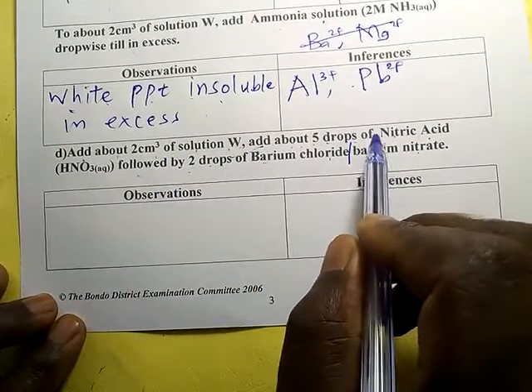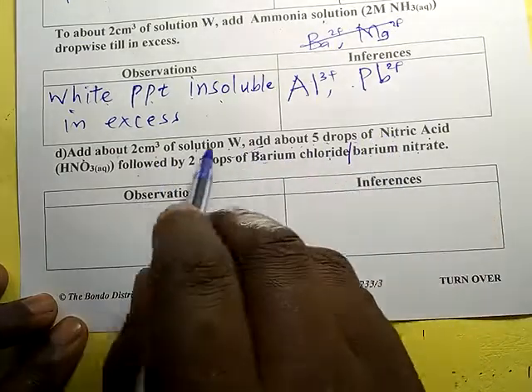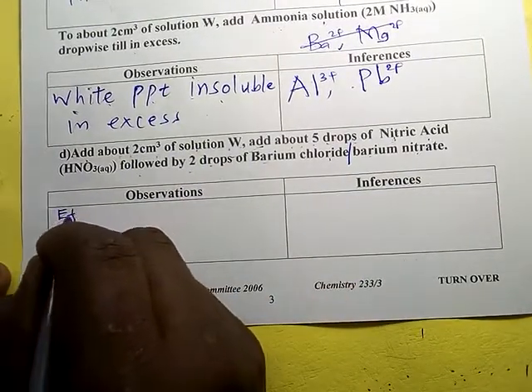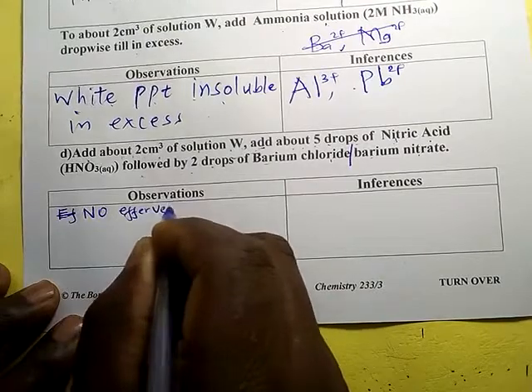Whenever you are adding an acid to a solution or to a solid, the first observation is effervescence occurs or it does not occur. But for this case, there was no effervescence.